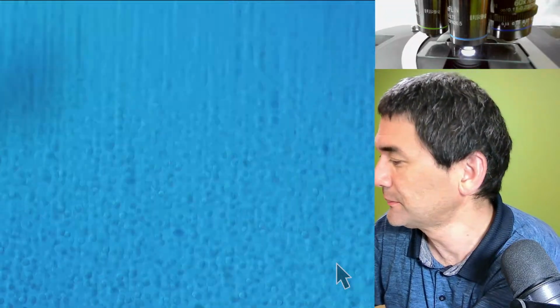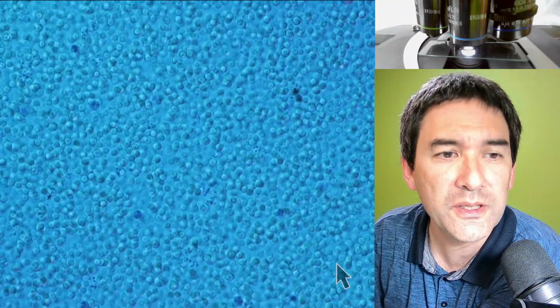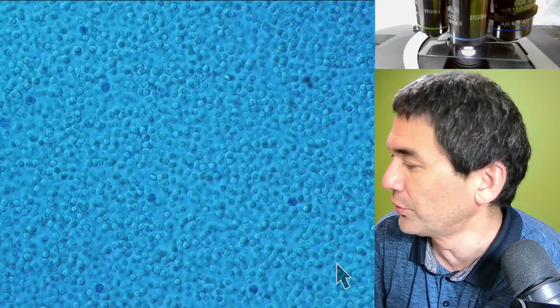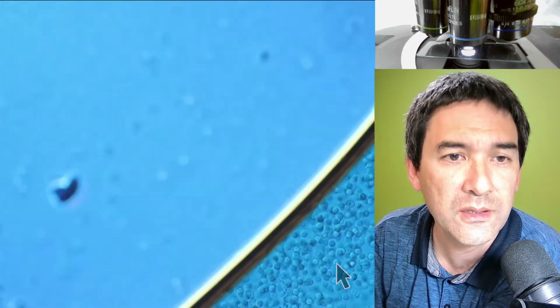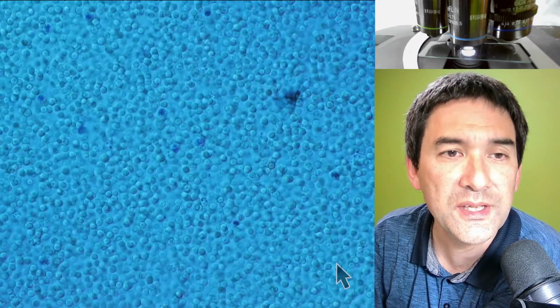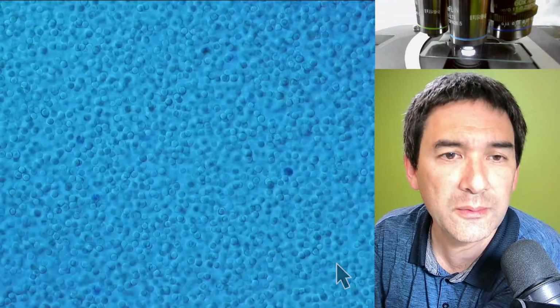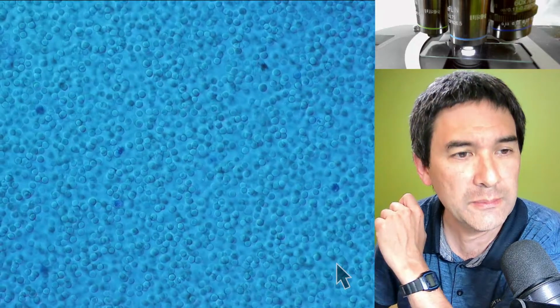You see, there are too many of them. That's why they're kind of overlapping a little bit, but I can already see what I wanted to show you. But actually, it's better when there are fewer cells. I've already seen some stained white blood cells. But okay, I'm going to now do the following. I'm going to repeat this with a little bit less liquid.